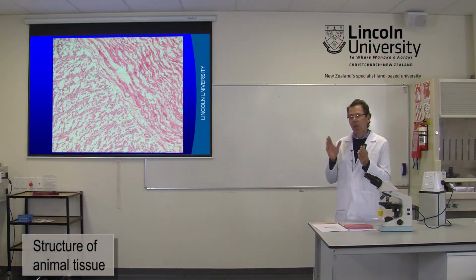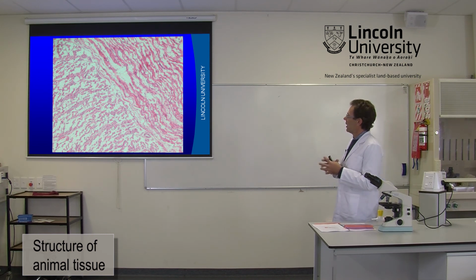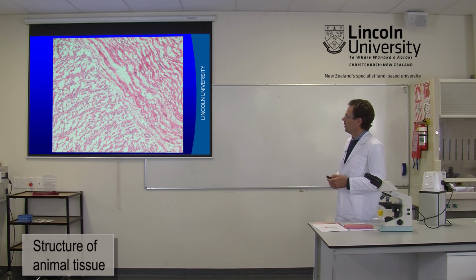And the reason that there's so much air there is that when the thin section of the tongue is cut, the cells very quickly dry up and start to contract. So that's an artifact of the processing. That white space wouldn't be there if in the animal in real life.